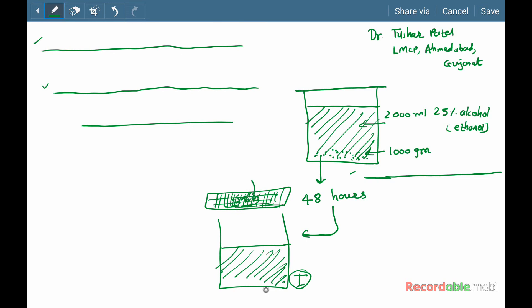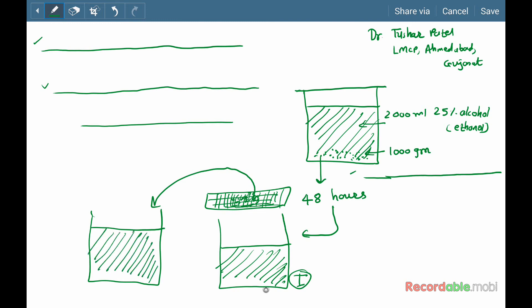After that, again macerate these pieces of the orange peel with 700 ml of 25 percent ethanol. This is 700 ml of 25 percent ethanol. Keep this aside for 24 hours for maceration. After that, again filter this solution.